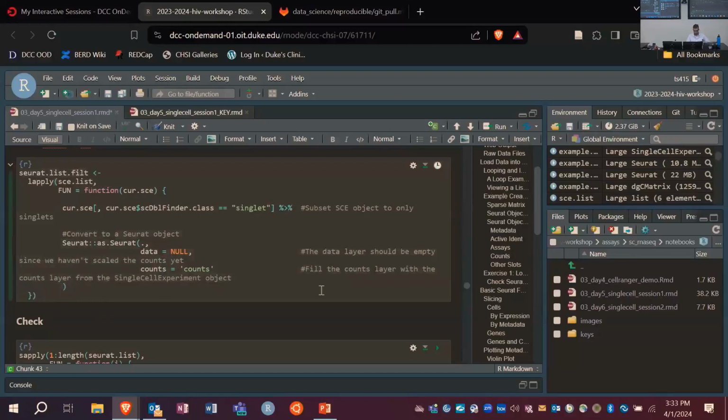So let me just go ahead and run that. Is that kind of similar to what you guys had done? Yeah. All right, great.